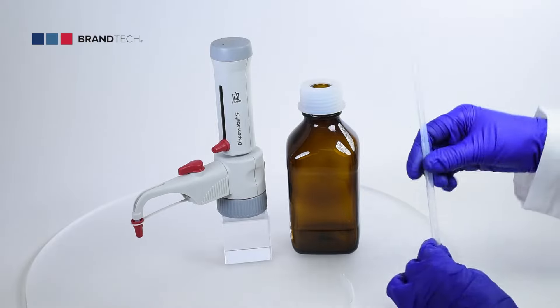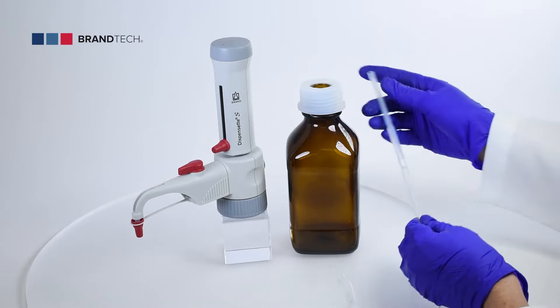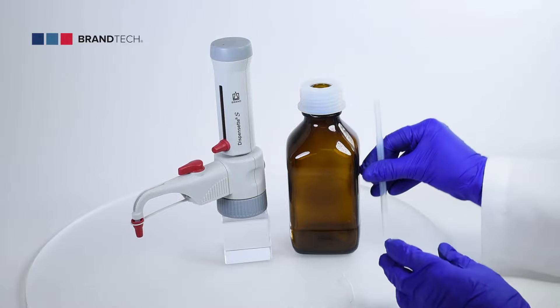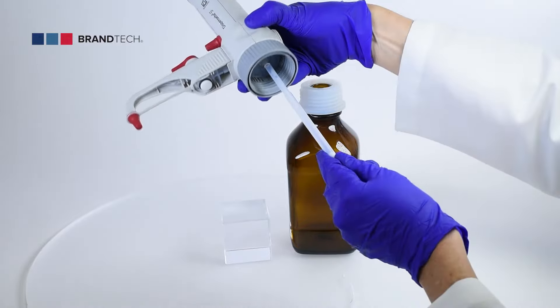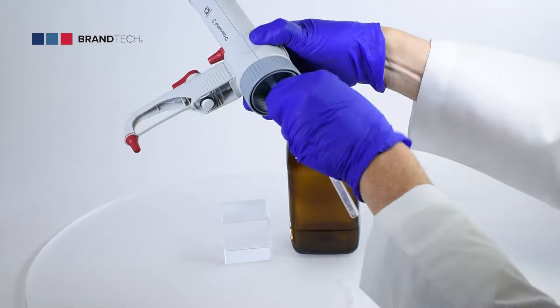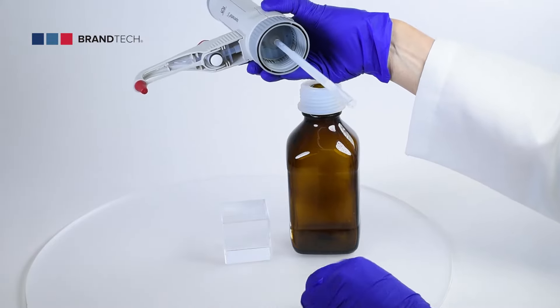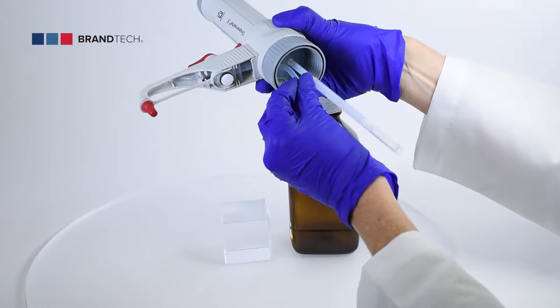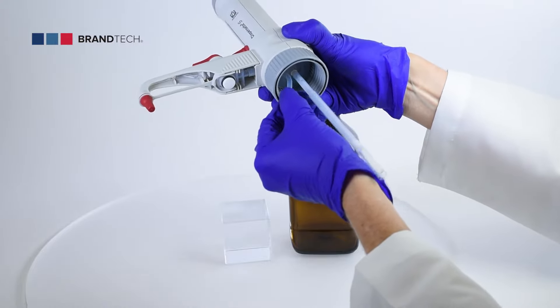Adjust the length of the telescoping filling tube to the height of your bottle and attach. If your dispenser uses a discharge tube with a recirculation valve, the recirculation tube must also be installed. Insert the tube with the opening pointing outward.